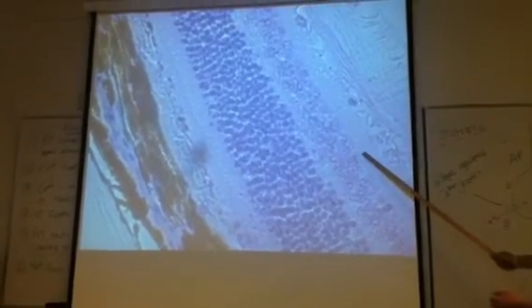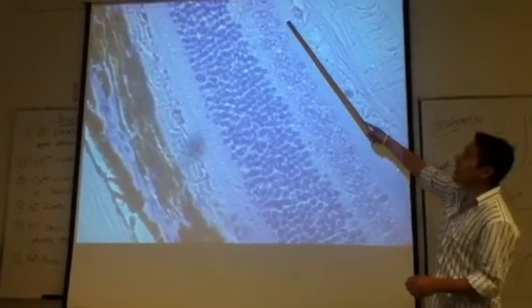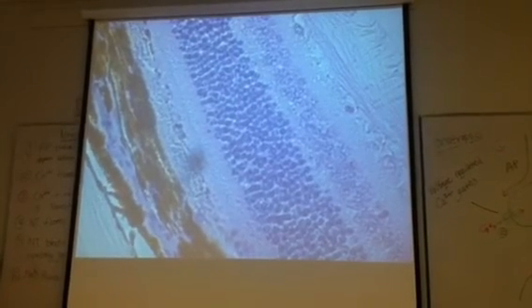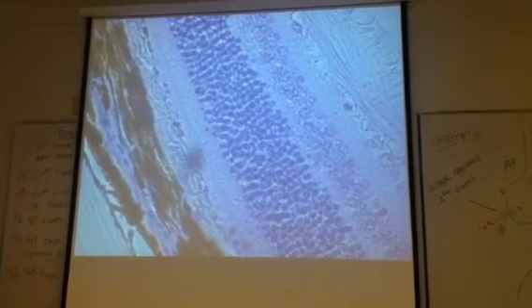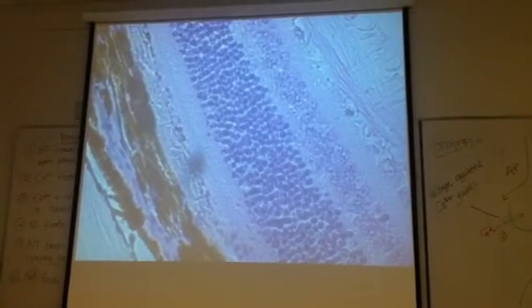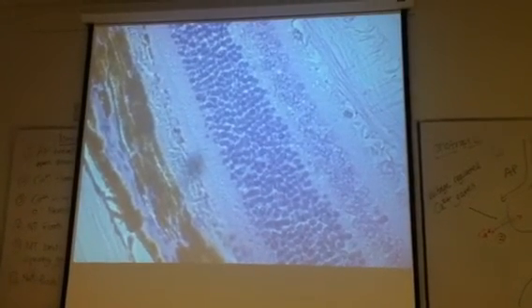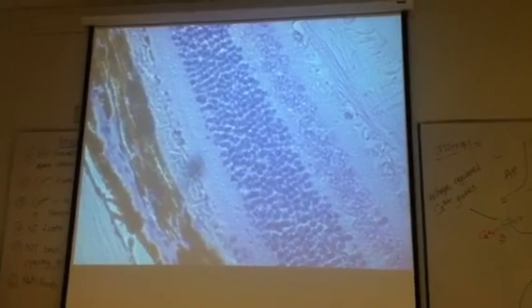Okay? So, then there's this other thin layer right here. What is that then? The axons of the bipolar cells and the dendrites of the ganglion cells. Yes. The axons of the bipolar cells and the dendrites of the ganglion cells. Or the synapses between the bipolar cells and the ganglion cells. Right? For my students, that would be everything you need to know.